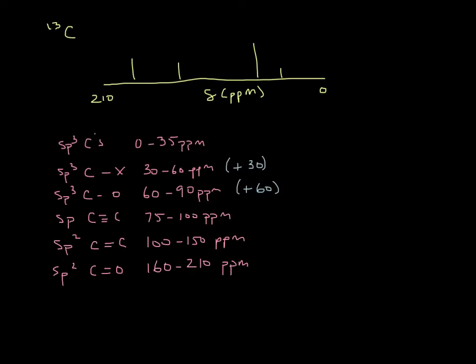You may recall that there is a third and a fourth thing that we can tell from hydrogen NMR. The third thing is the area under the curve, which tells you the number of protons in that environment. Unfortunately, that doesn't work very well for carbon NMR. Therefore, there's really no integrating to be done for these, and we don't ever have to worry about the number of carbons in that specific environment.